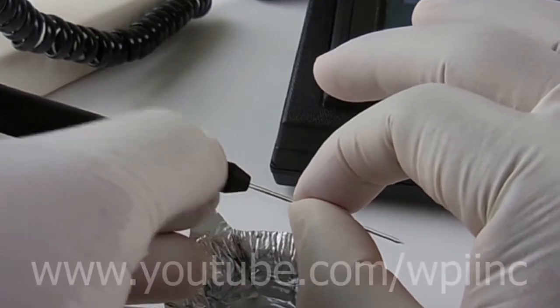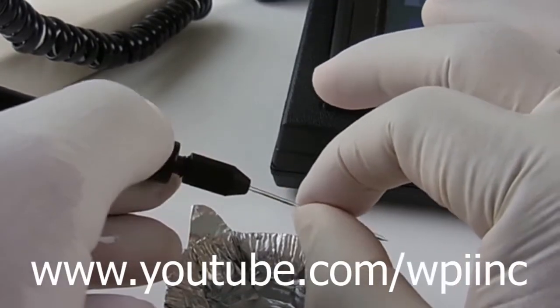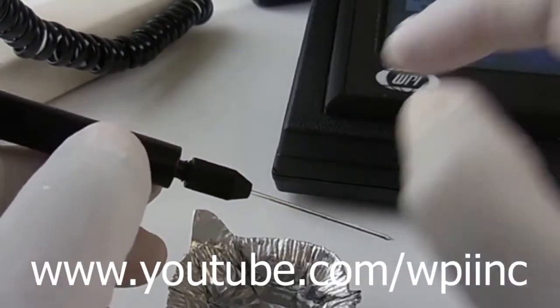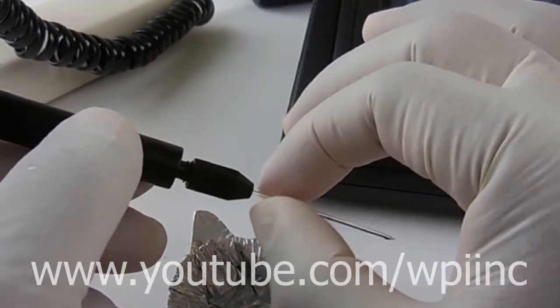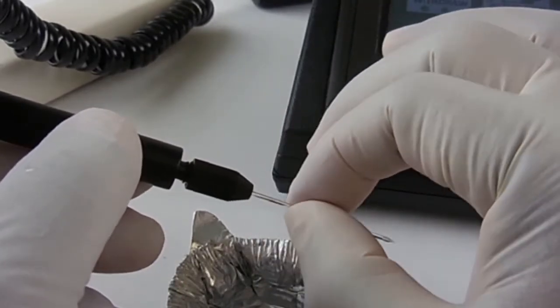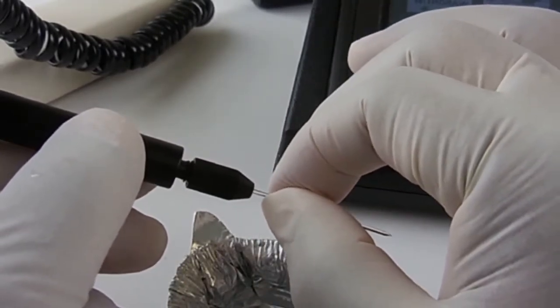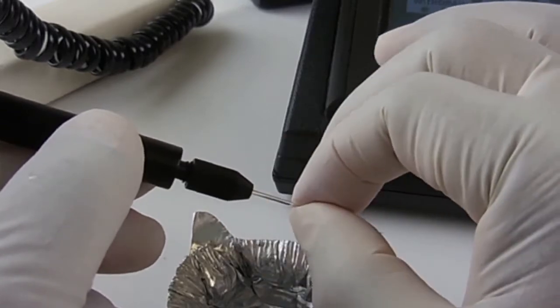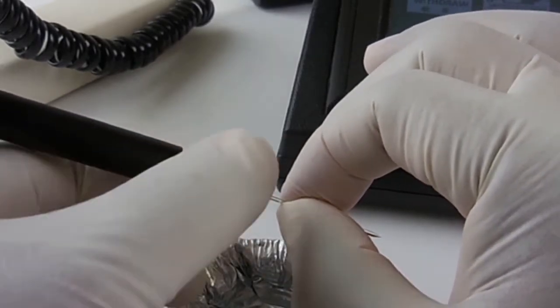We have a YouTube video on how to change the O-rings and how to put the glass into the injector. Once you have securely put the micropipette into the injector, you are now ready to set the parameters on the Micro 2T smart touch controller.